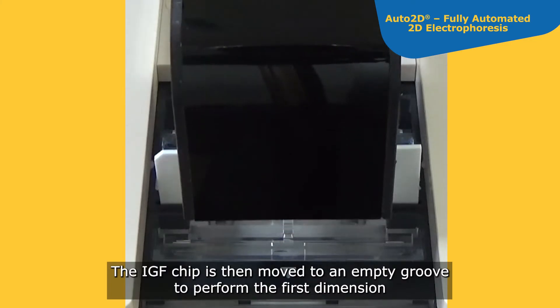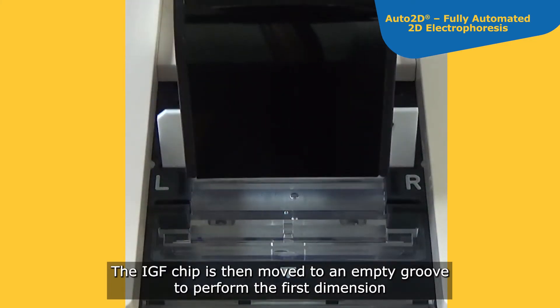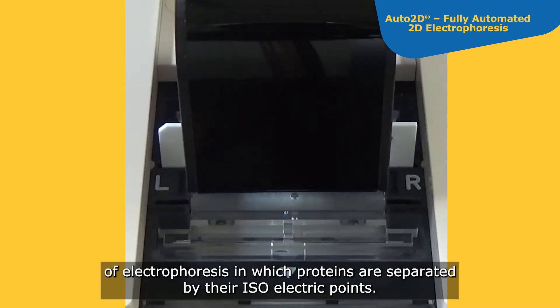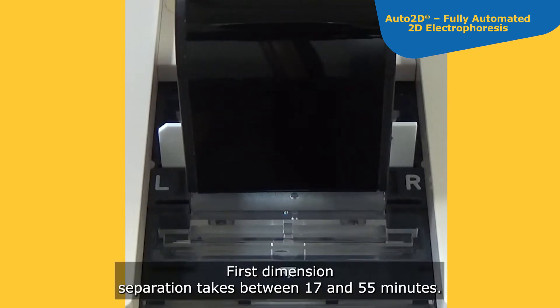The IEF chip is then moved to an empty groove to perform the first dimension of electrophoresis, in which proteins are separated by their isoelectric points at a high voltage. First dimension separation takes between 17 and 55 minutes.